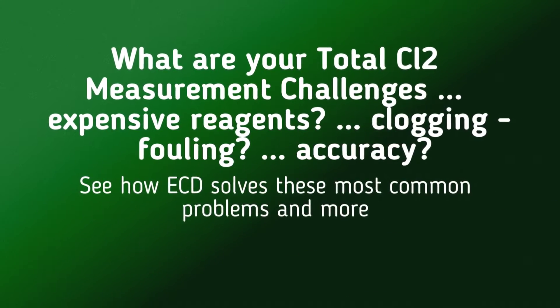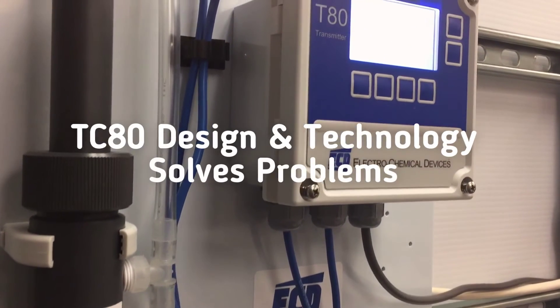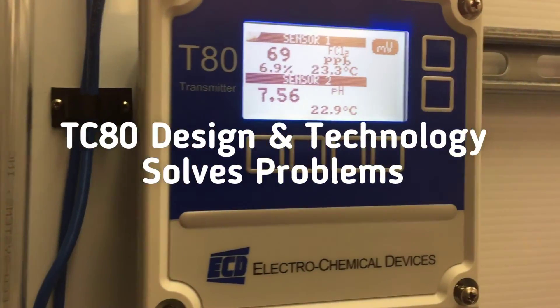Total chlorine measurement challenges include expensive reagents, clogging and fouling, and accuracy. See how ECD tackles these challenges with the design and technologies of the model TC80.